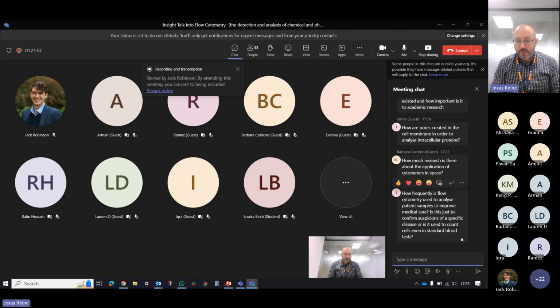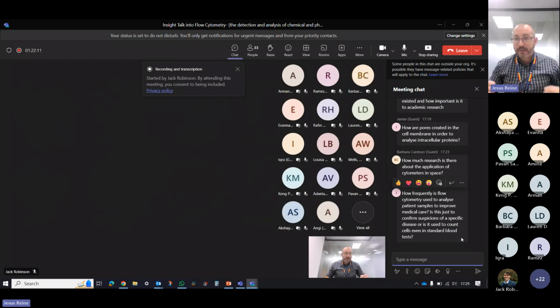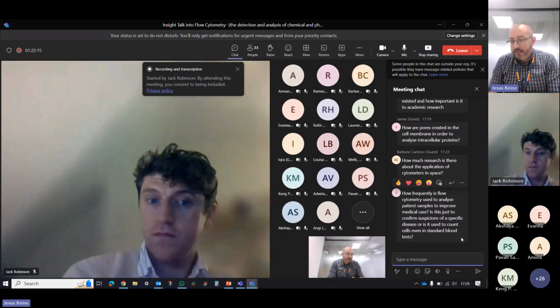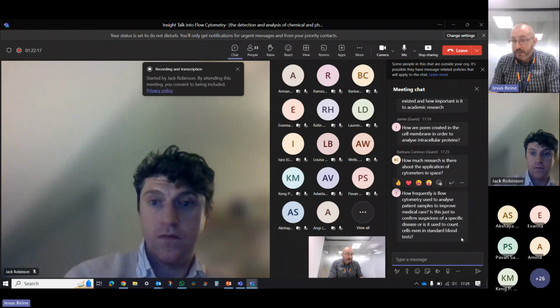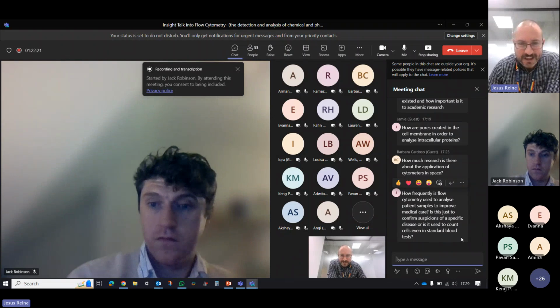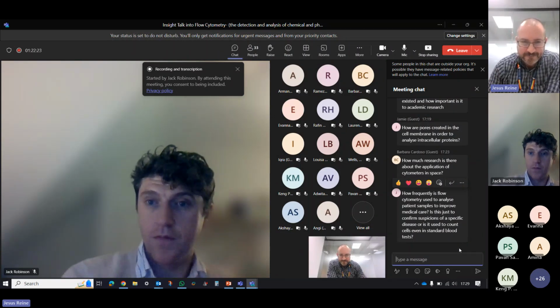And one thing that we're doing at the moment, in general, all the networks, is creating very huge databases online from many, many people, patients and also healthy volunteers. And when a sample arrives, we can identify much better if the sample is compatible with a specific disease or not. So I think, Jack, you want to say something?